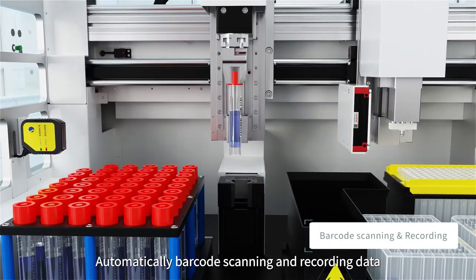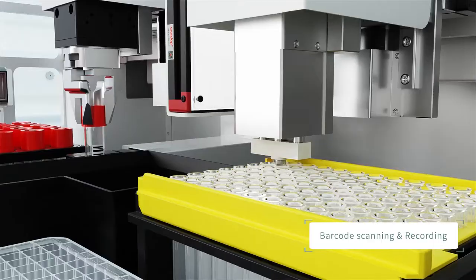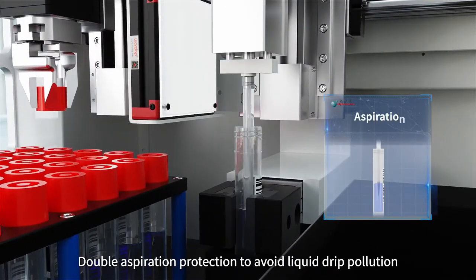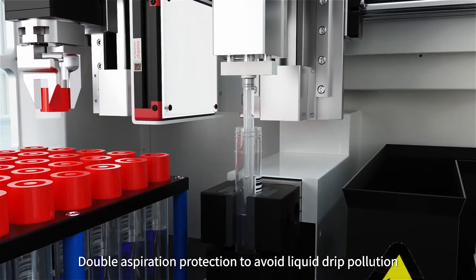Automatically barcode scanning and recording data. Double aspiration protection to avoid liquid drip pollution.